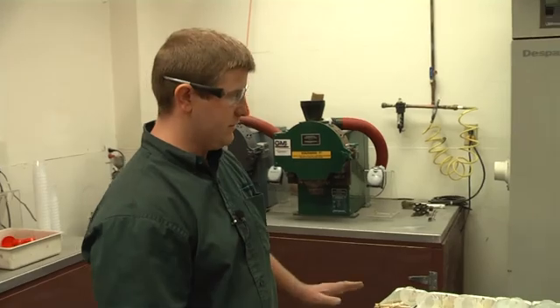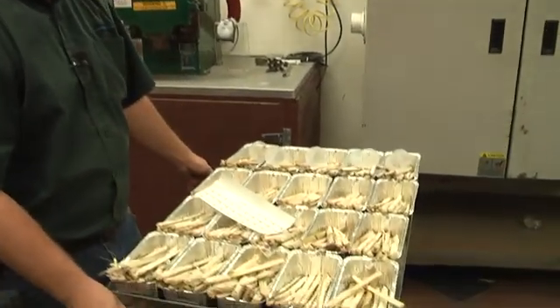All right Craig, here we go. We are rolling. We're in the final stage back here in the receiving room. This is the prep stage. These are the samples that we just pulled out of the oven.